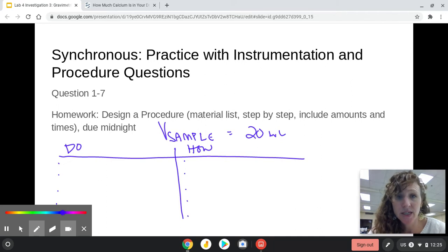Another approach you could take is trying this experiment with a couple different trials. You could kind of do something similar to what we do when we're heating the water off of the filter paper. You could run a trial where you mix in a half a gram of sodium carbonate, and then you could run a second trial where you mix in a whole gram, and then a third trial where you mix in 1.5 grams, and then a fourth trial where you mix in 2 grams.